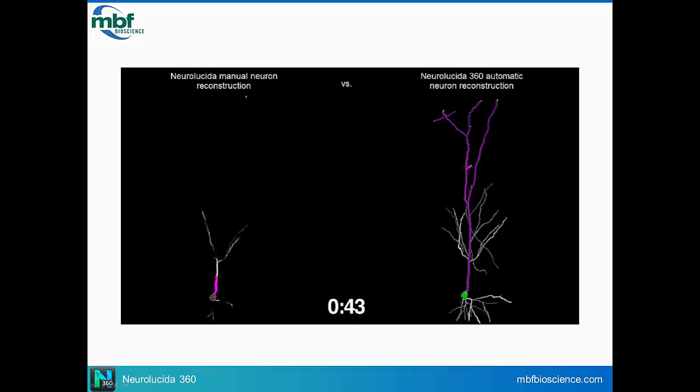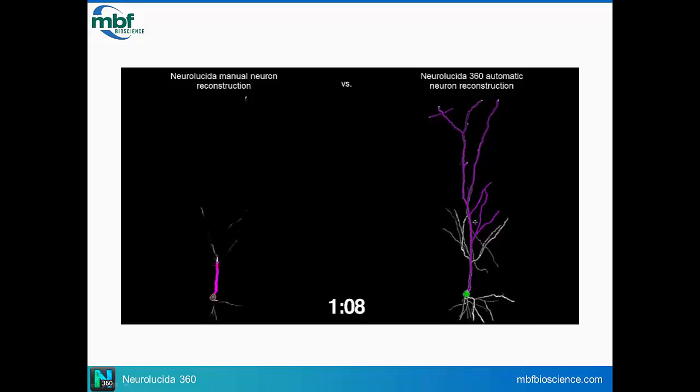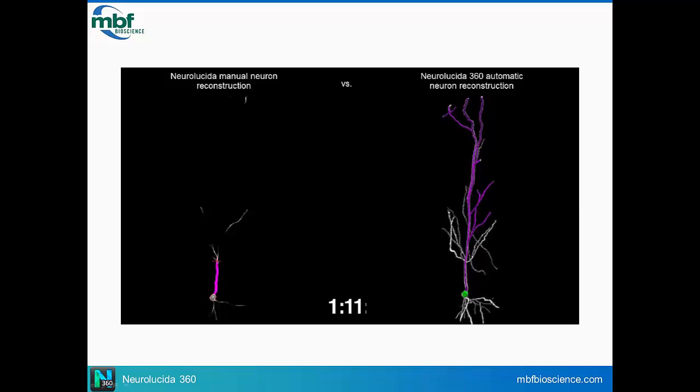We are working with them now, and we are continuing to add more tools that allow people to image and analyze subsets of data in ways that make sense to them. So we've got a couple ways to do it right now, but part of the process of this development is making the tools very extensible for the different ways that people like to work. So sort of a user experience perspective. And definitely contact us, and we'll see how I can show you that our software works for your Clarity tissue.